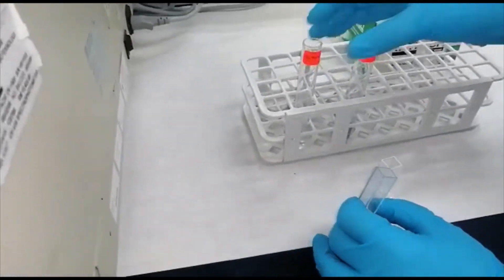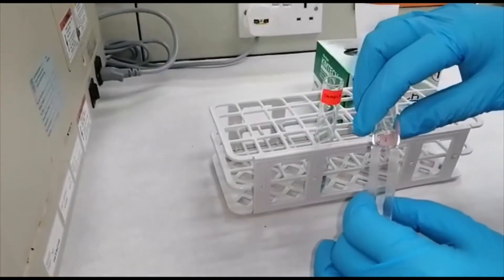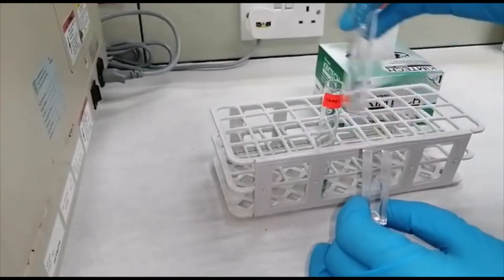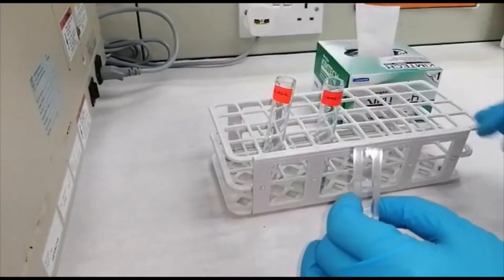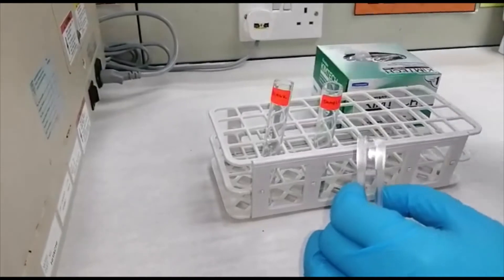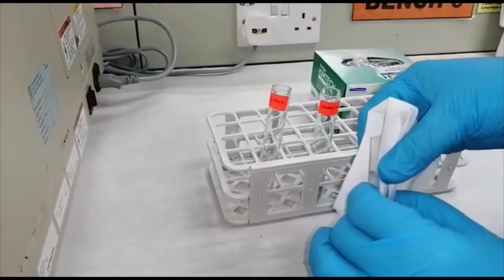Tuang larutan pengosong ke dalam kuvet. Pastikan isi padu melebihi 1 per 3 isi padu kuvet. Lapkan permukaan optik.